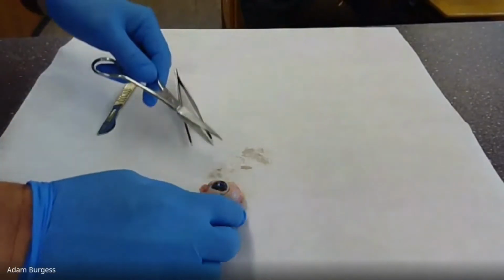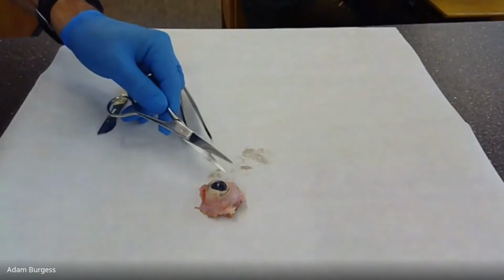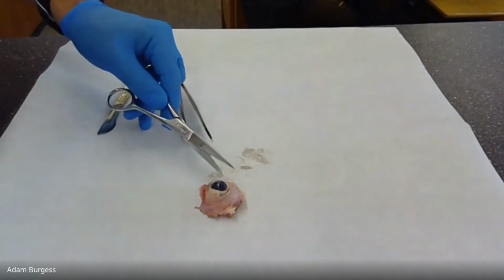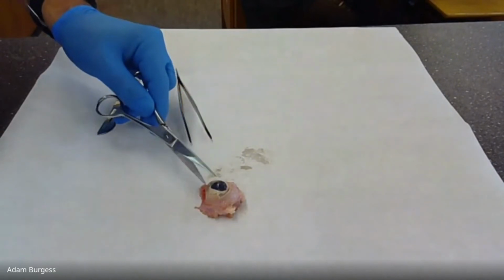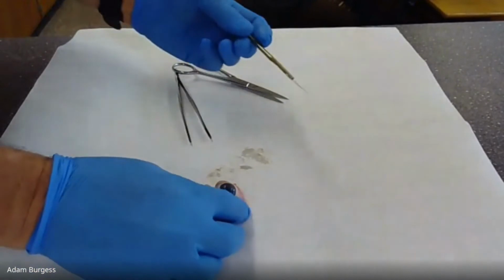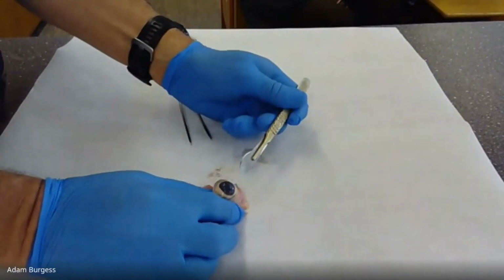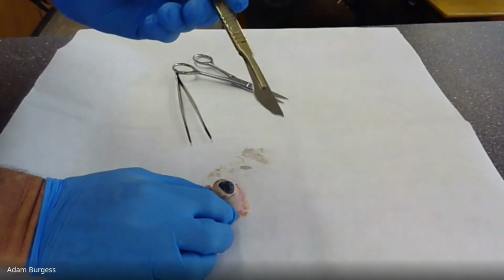We're going to try and dissect this part here. That's the cornea, with the aqueous humour, and then we're going to dissect into the sclera. But the first thing I'm going to show you is that the sclera itself is really tough. Look, now that is really sharp.